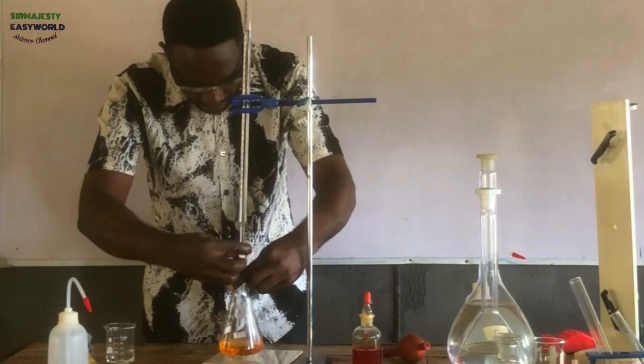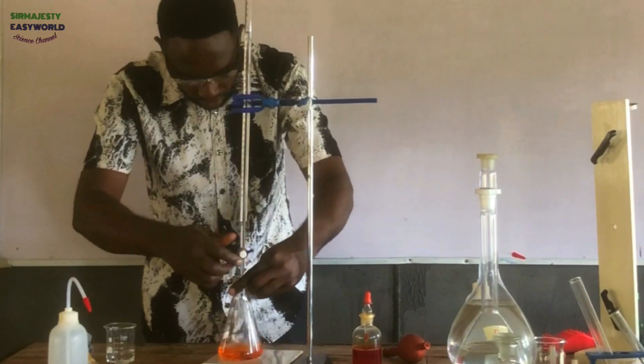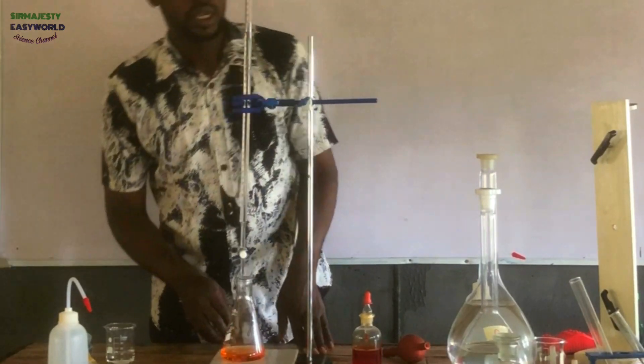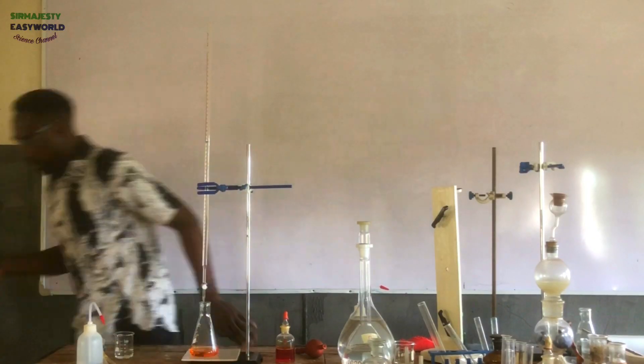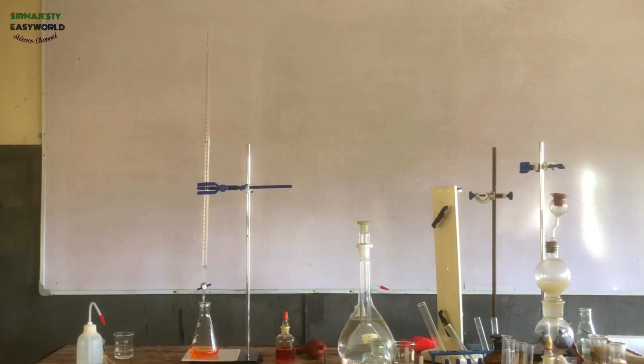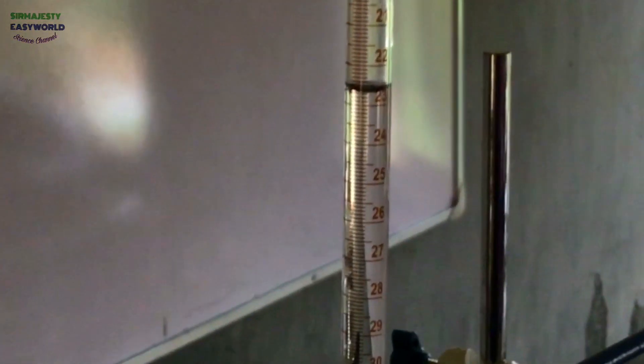I'll be adding little by little and shaking. When the color persists, I'm at the endpoint. You see — this is the endpoint. For a clearer view, I have to bring another camera very close for you to see the endpoint for the rough titration. From the camera point of view, we have 22.60.